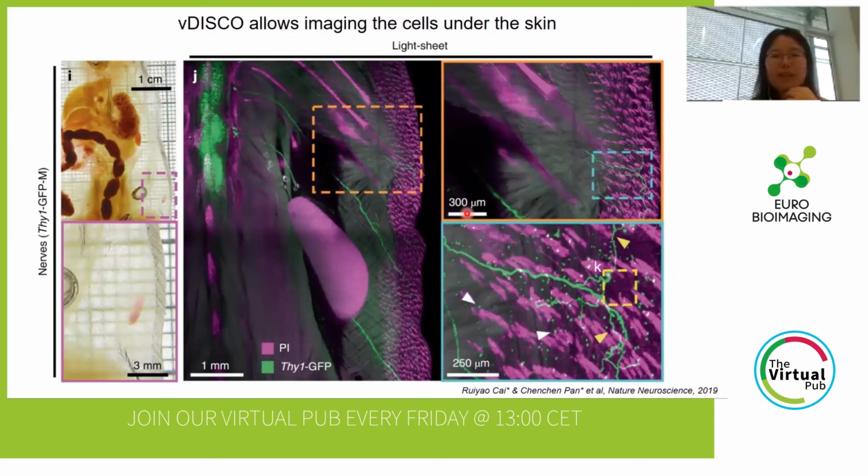Here, we can also image the cells under the skin. Traditionally, when people clear mouse organs, they peel off the skin. Here, we keep the intact skin. For example, with the Thy1-GFP-M mouse, we want to image the nerves under the skin.